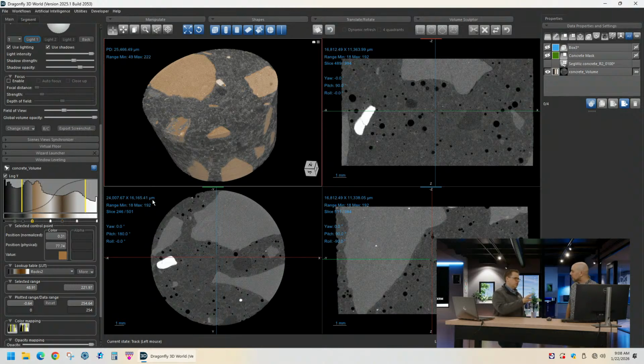Now, a little bit of thing on the program: I see that the color here is being applied to your 3D view, but it's not being applied to the 2D views. Right. If you click, you see the red line around this 3D box.